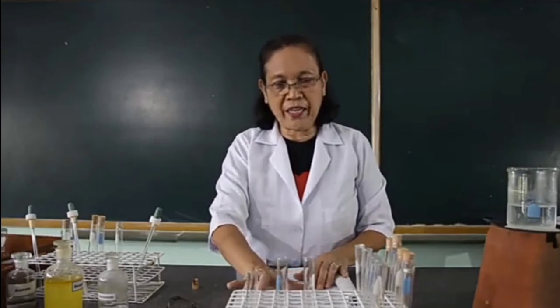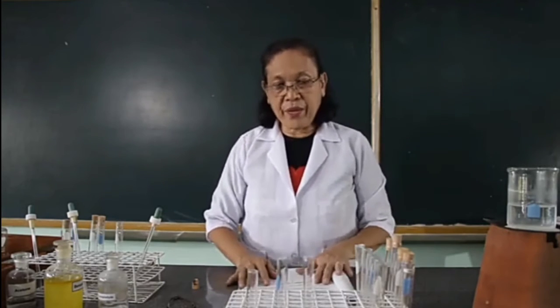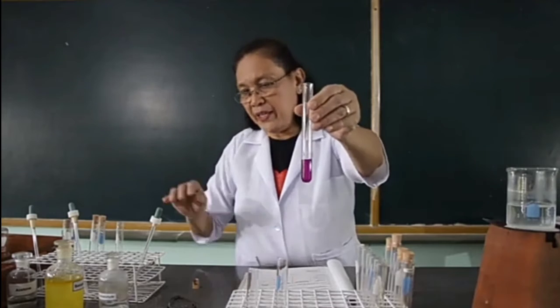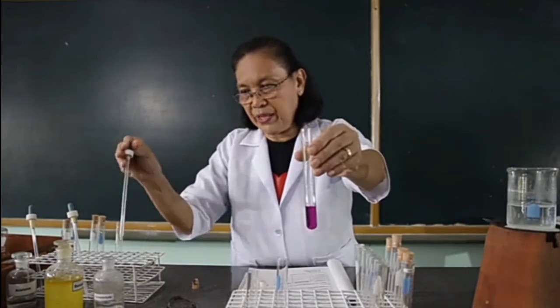We'll get again 3 test tubes. So these are now the test tubes containing the potassium permanganate and the dilute sulfuric acid to test for the oxidation reaction of the aldehydes and ketones. So to the first test tube, we are going to add the aldehyde. I want you to observe what happens.